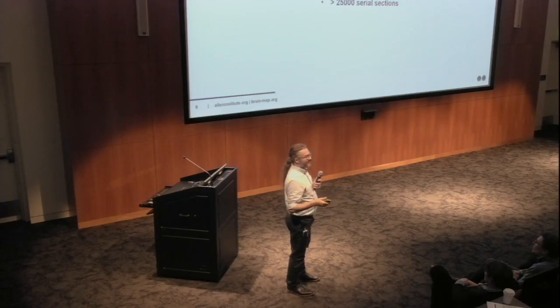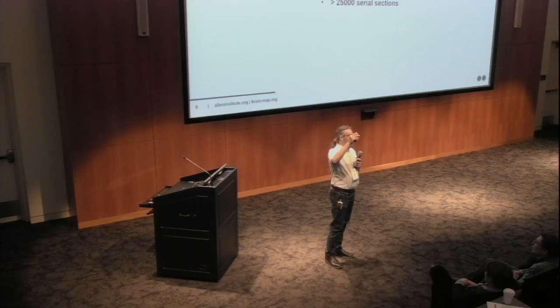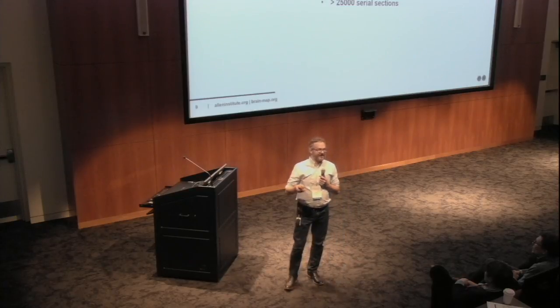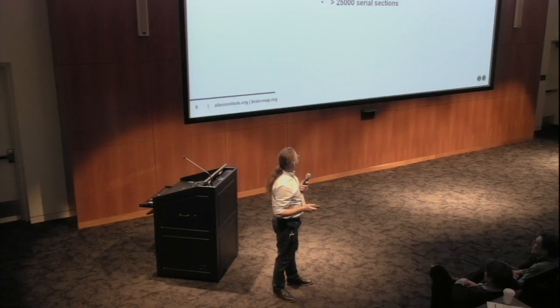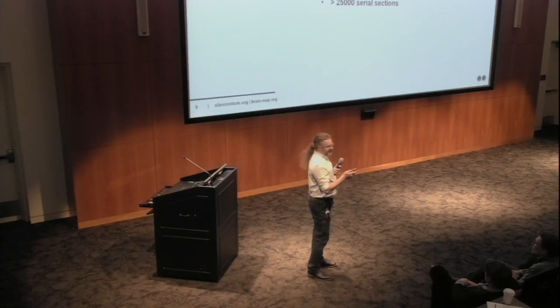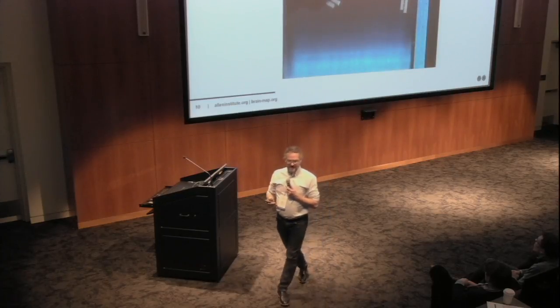For example, if you were to cut a human hair at 40 nanometers, it would take you about 2,500 slices. And to get through that millimeter volume, we have to cut 25,000 slices. And that's just unfathomably thin and an unbelievably difficult task to do. This is how it has historically been done.